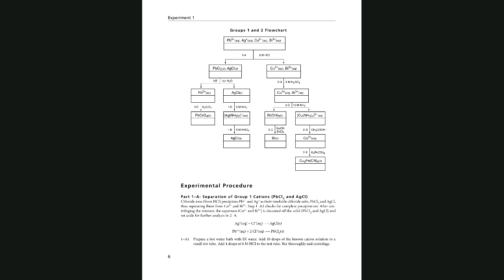We place the test tube with another test tube in the opposite direction, and you are going to see the precipitate settle down. You have clear liquid on top, and you decant from the test tube to another test tube to separate the solid from the liquid. Then you look at the reagent. You're adding H2O.